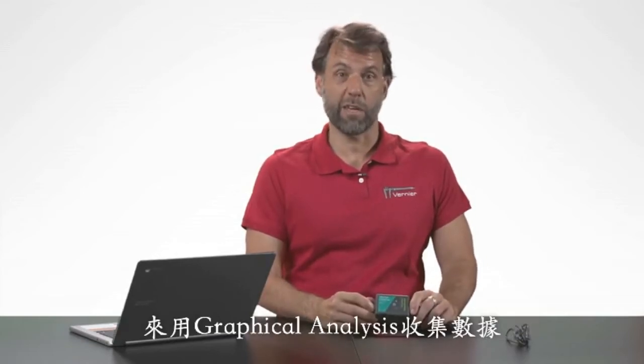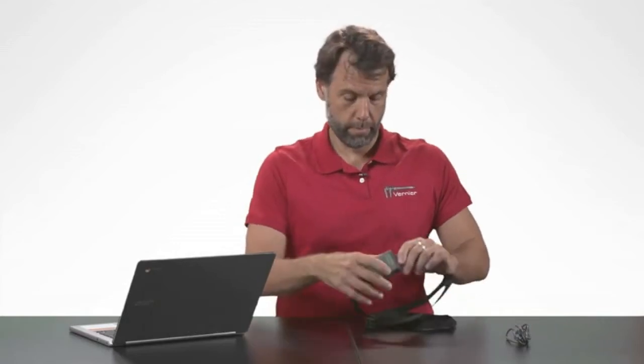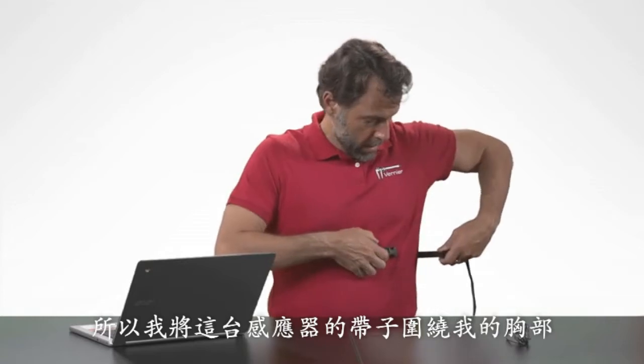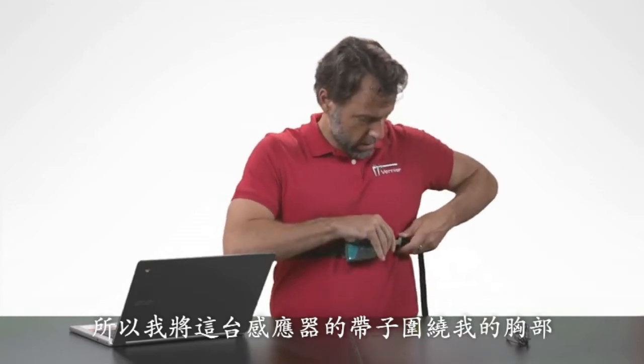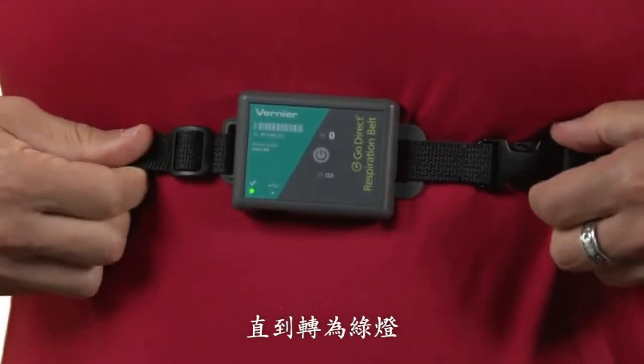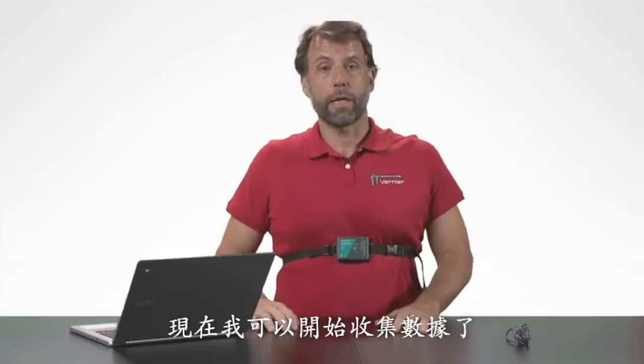So I'm going to put this around my chest and then use Bluetooth wireless technology to collect some data using Graphical Analysis. I'm going to put this sensor around my chest, snap the belt, pull it until the light goes green, and now I'm ready to collect data.